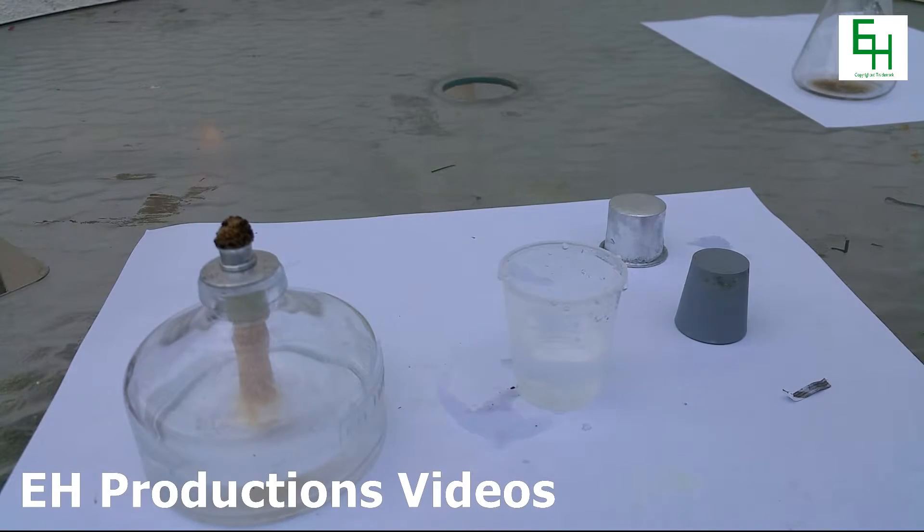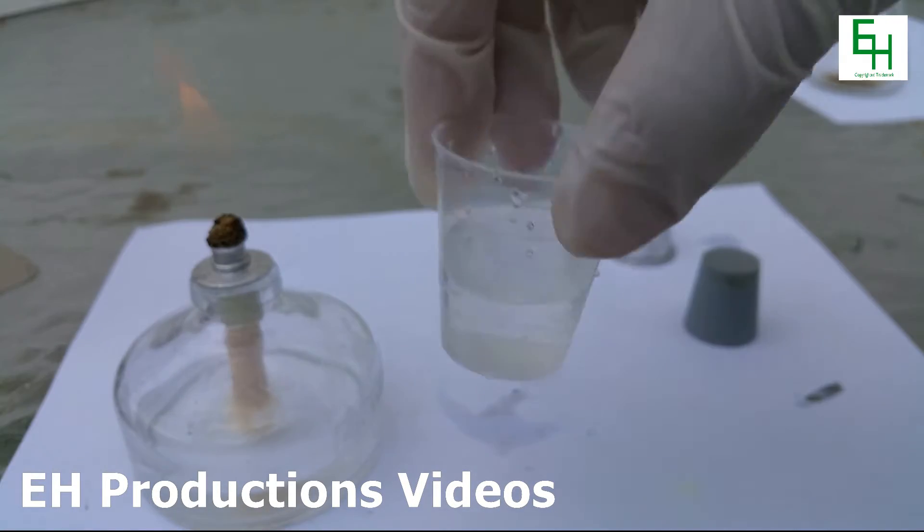In this video I'll be showing you guys how to make some plastic sulfur. First get a cup of water which we'll be using later.